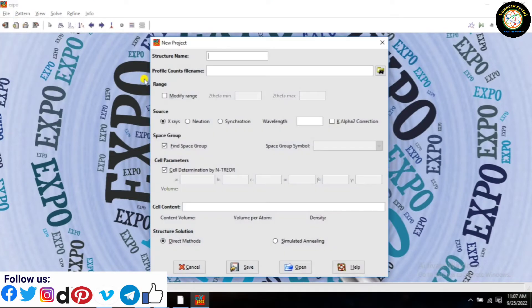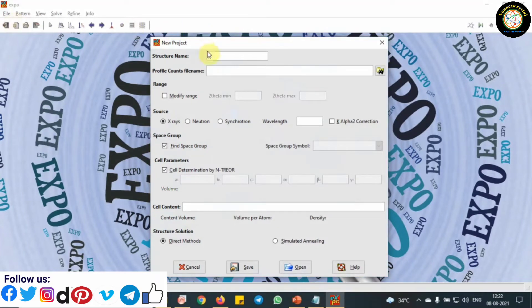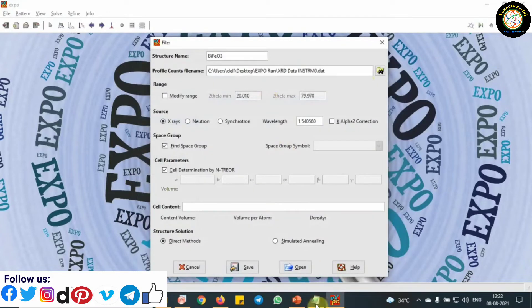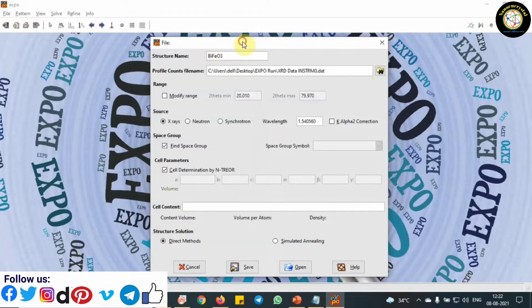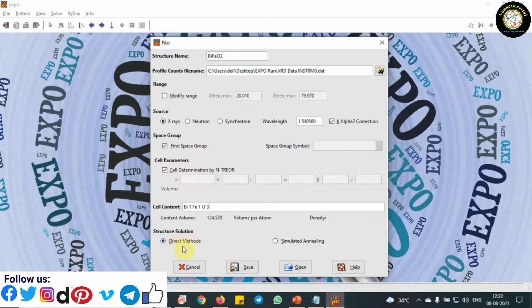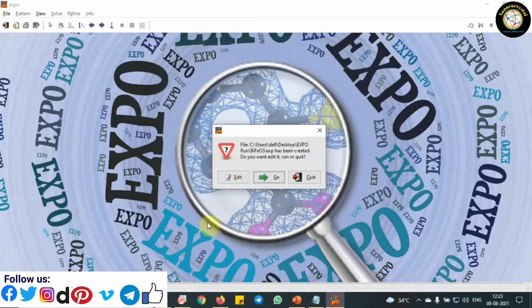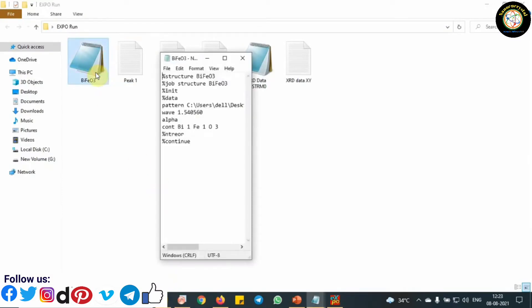Go to File. After that, click New and fill the details in the dialog box. The profile count file name should be in this format: First Angle, Step Size, and Last Angle. Click on Save. After that, the Expo file format will be created, like this.